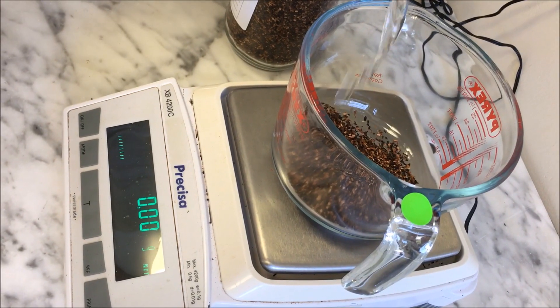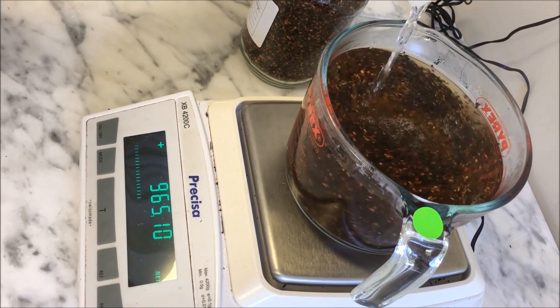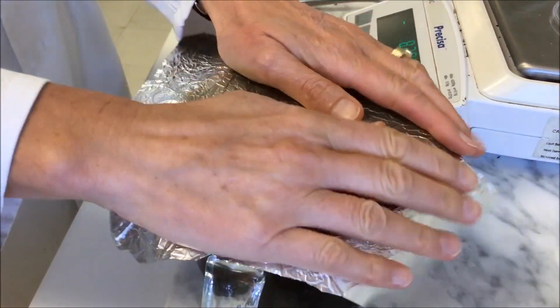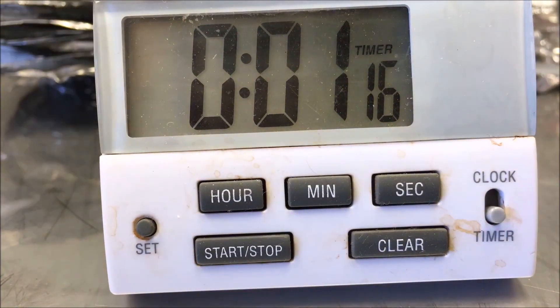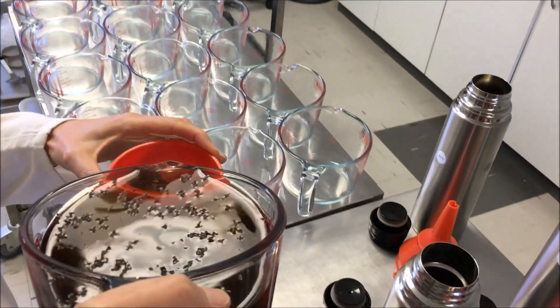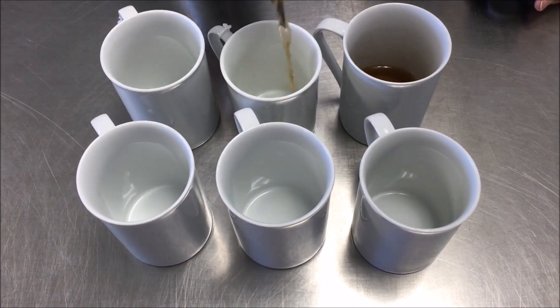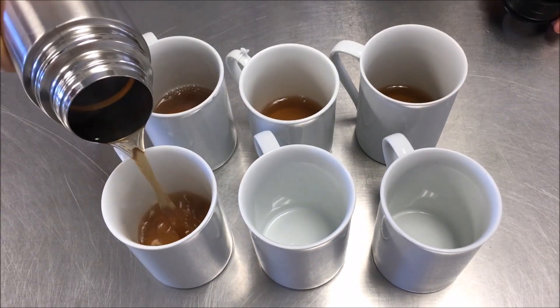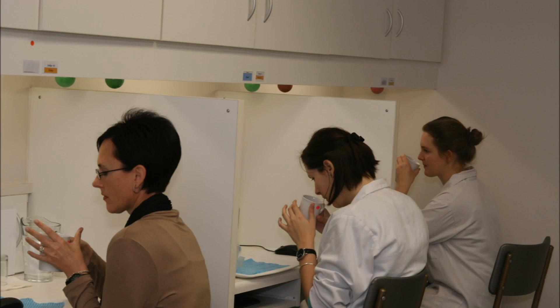The Honeybush tea infusions are prepared according to a standard protocol. The tea bag fraction is weighed and freshly boiled distilled water is added. The mixture is steeped for 5 minutes and strained into a preheated vacuum flask. The infusions are served in mugs that are kept warm in a heated water bath. This is important to ensure that the infusions are evaluated at the same temperature.